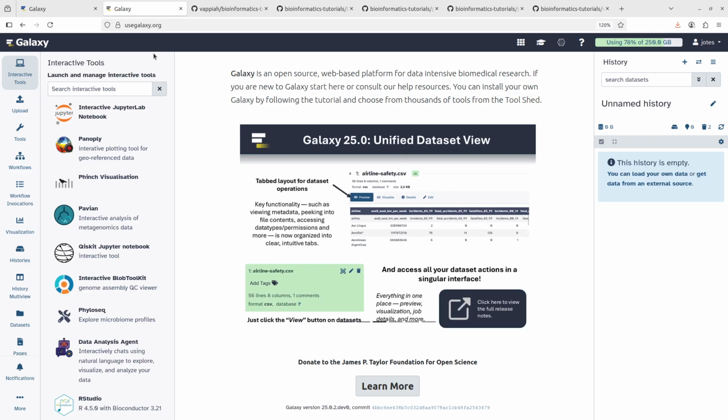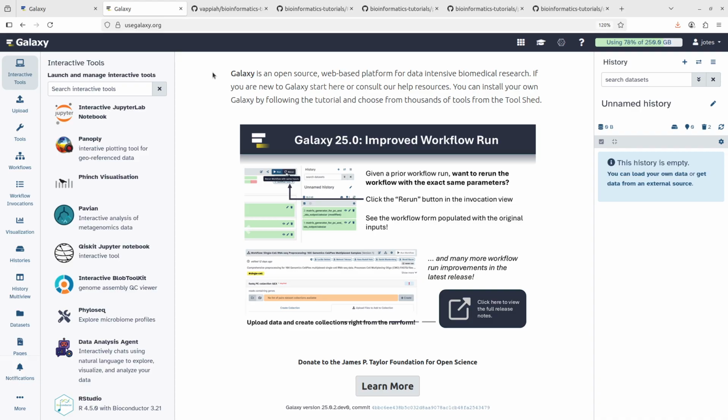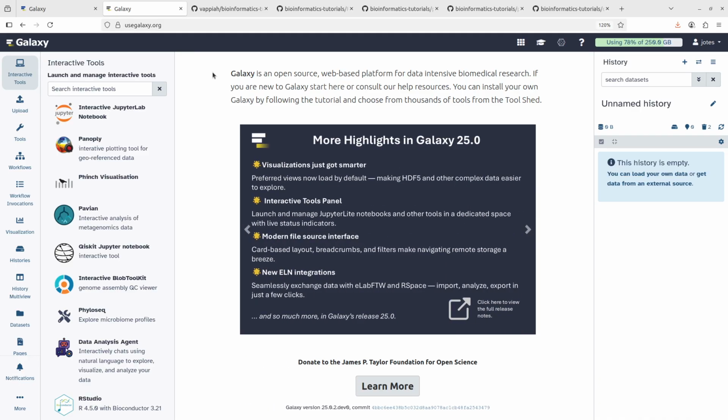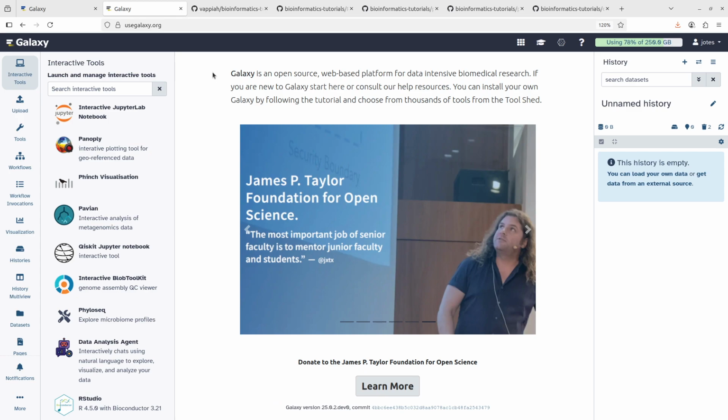Okay. Now we are going to start with the coding. So I'll start with how you can use Galaxy to do your Bash stuff, Linux commands, and then Python. So I'll start with that one first, and then we switch to R.